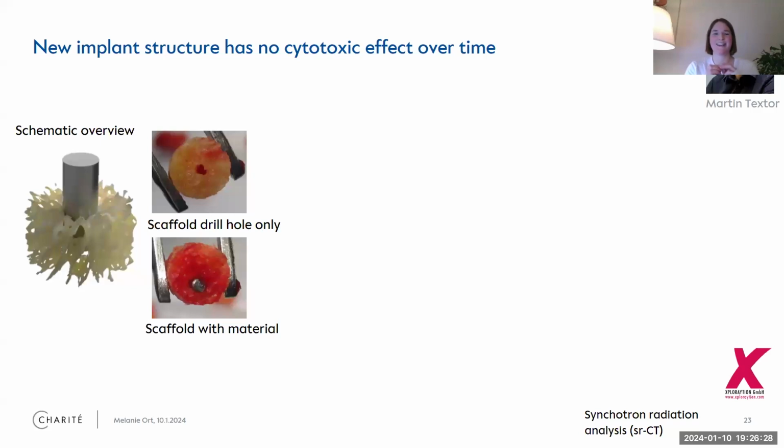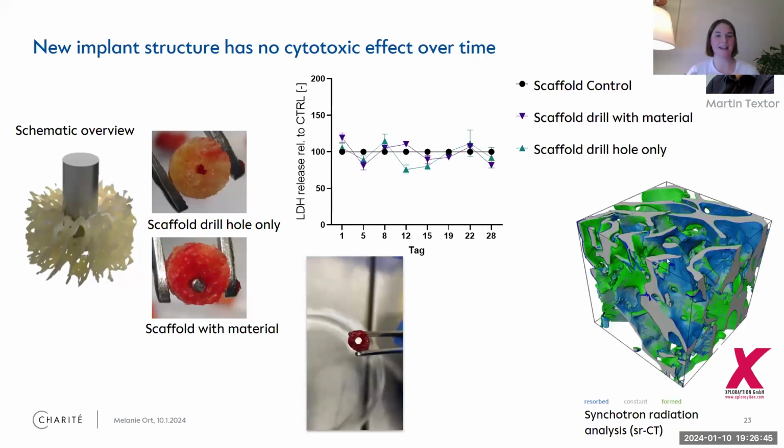And I just want to say that all of those things, no company is helping you with these kinds of things. So Martin had to be super creative how to drill a tiny hole into a tiny bony piece and then insert this tiny new material into it. But he did that and he monitored again LDH, so the cytotoxicity. And what is nice is that Martin could, or we could actually report that this new idea was not, at first look, that bad for the bone.